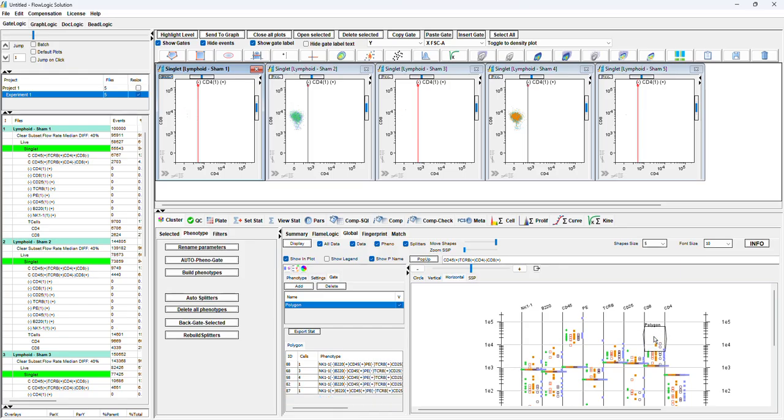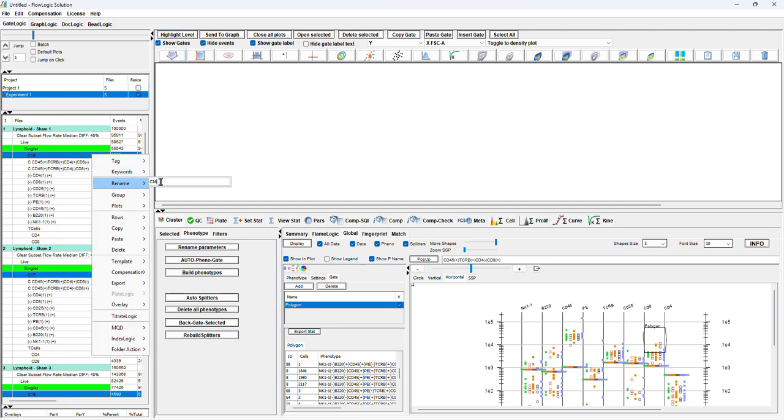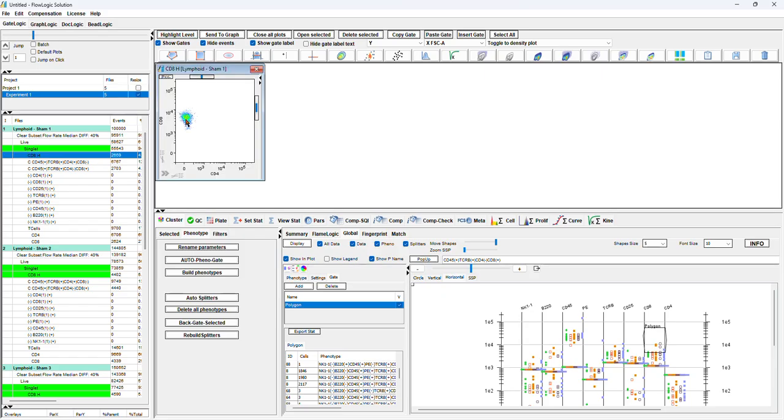And if you want an extraction of just some, because this will be just CD8 high, nothing easier, and then you go and highlight the level and rename CD8 high, or just H is enough, and all of them are renamed, and then you extract your CD8 high.